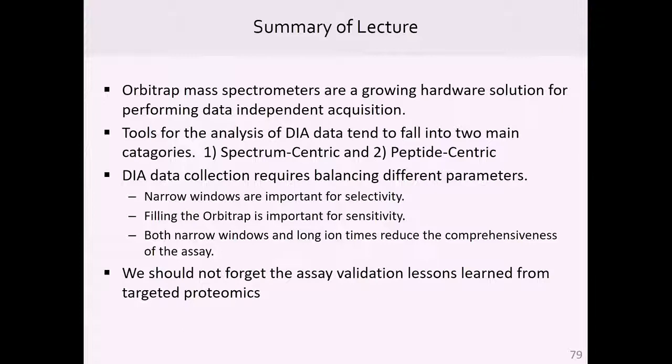And so that means that now you're only increasing the amount until you hit that maximum inject time, which is why we think keeping the maximum inject time high is a pretty important component, because you want to ensure that you always fill the Orbitrap, which means you gain the highest enrichment that you possibly could. With these brighter sources, this is going to mean your maximum inject time can go down a little bit. Yeah, that's definitely a case.